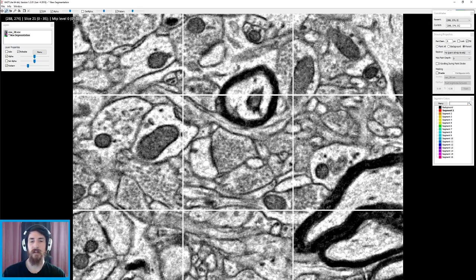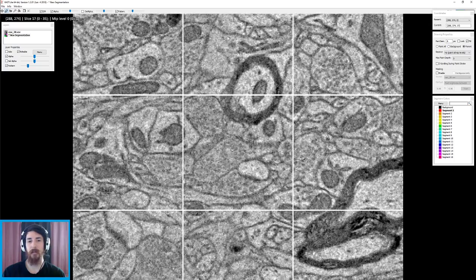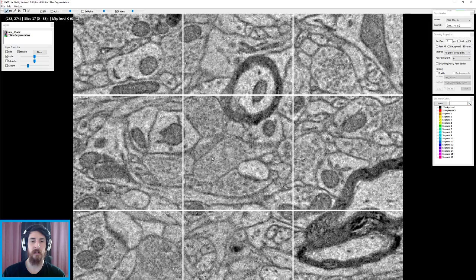Okay. I might speed this part up, who knows? Probably not because I'm lazy, but let's go. Alright, so segment 1, here we go. Parallel boundaries. These are tough, guys. These are tough, especially in this grainy data set. There's going to be a lot of guesswork. We were specifically told to hallucinate boundaries because we want to err on the side of less painting than more painting, so that the boundary detector is over guessing, or at least not putting more things together than it is separating them.